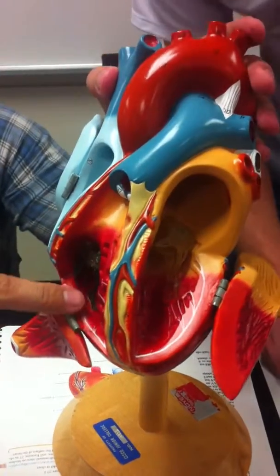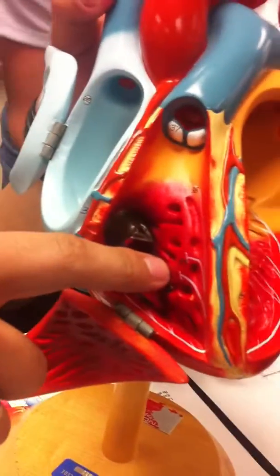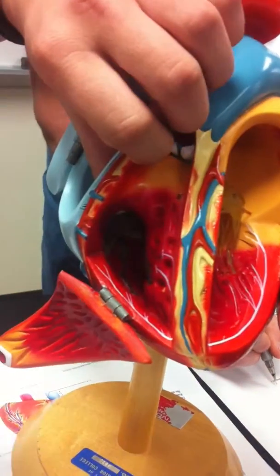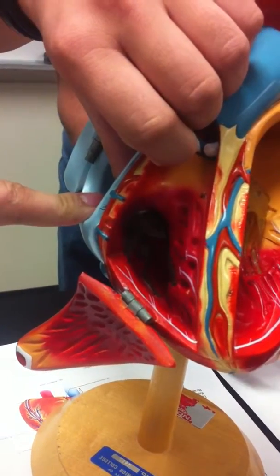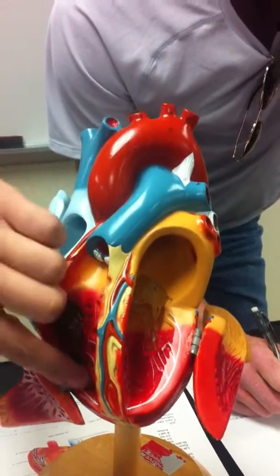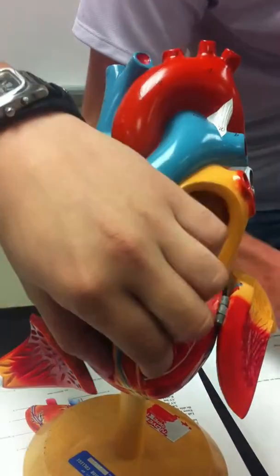Papillary muscles are the conjoining part of the tricuspid valve. It's the papillary muscles down here, chordae tendineae above, right where it attaches from the right atrium to the ventricle. Papillary muscles on the bottom, chordae tendineae on the top. The interventricular septum right here in the middle.